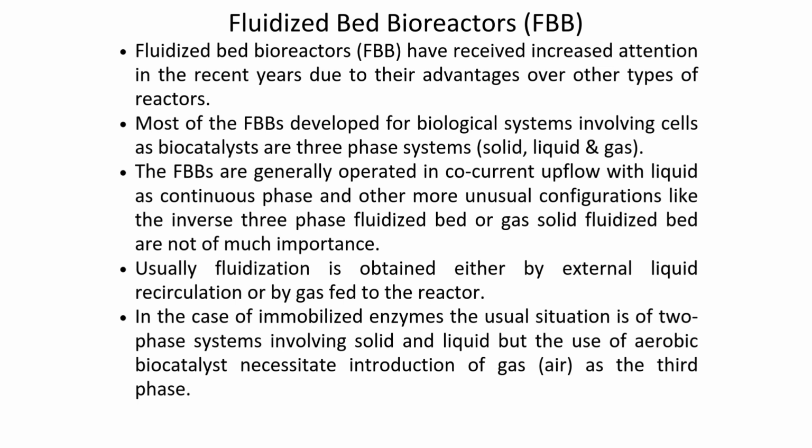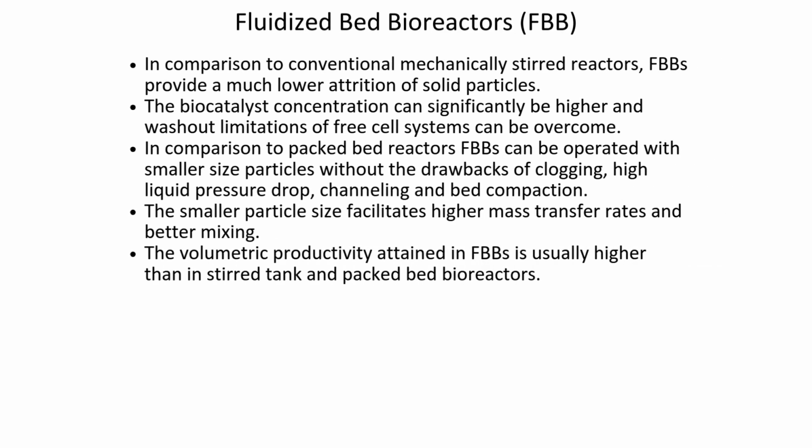When working with immobilized enzymes, the system is typically a two-phase solid-liquid system, but using an aerobic biocatalyst requires introducing gas like air as a third phase. Following this, we notice the benefits of fluidized bed bioreactors. Compared to conventional mechanically stirred reactors, FBBs cause much less attrition or wearing down of solid particles. They can support a significantly higher concentration of biocatalyst and overcome the washout limitations common in free cell systems.